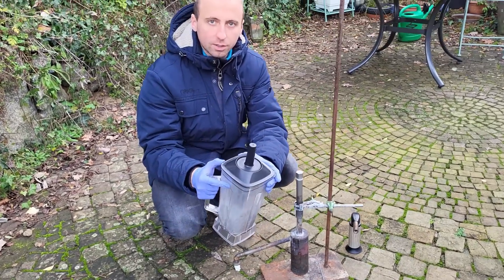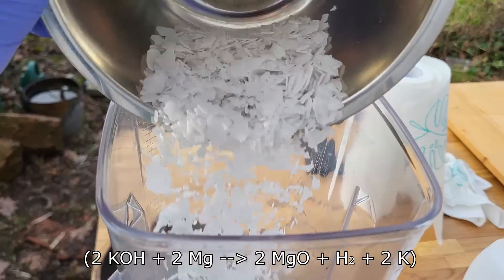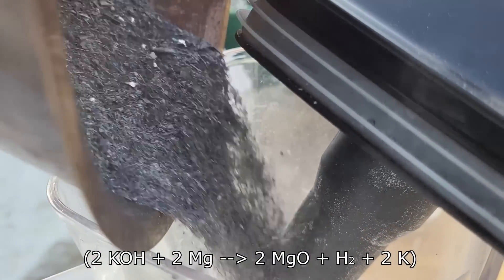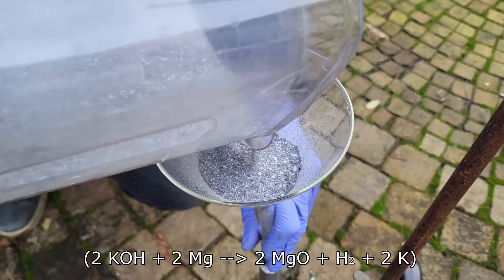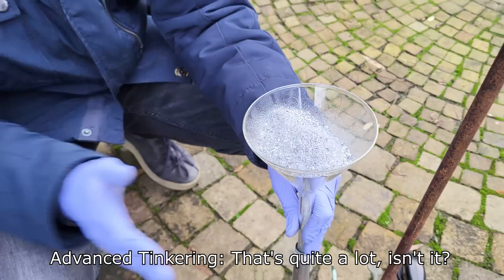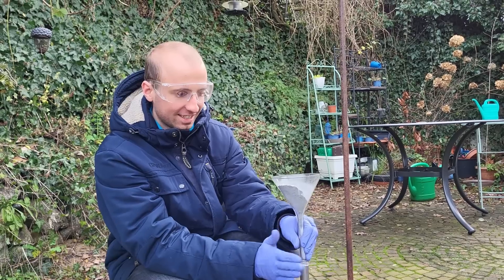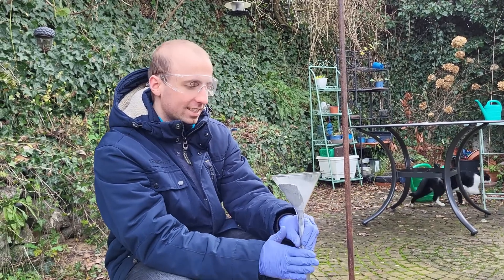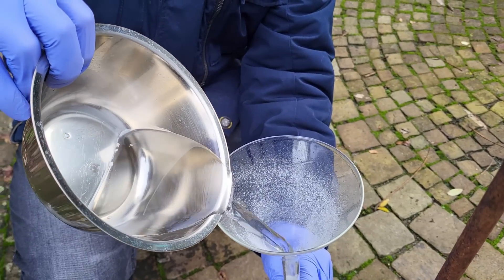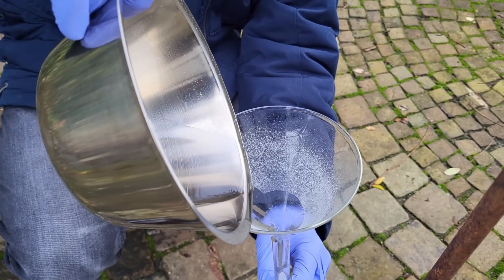Before you leave, let me quickly demonstrate why we can't scale up the same reaction with potassium hydroxide, by attempting the same process with 100 grams of potassium hydroxide and 100 grams of magnesium metal. In order to slow down the reaction, I will add 100 grams of mineral oil.